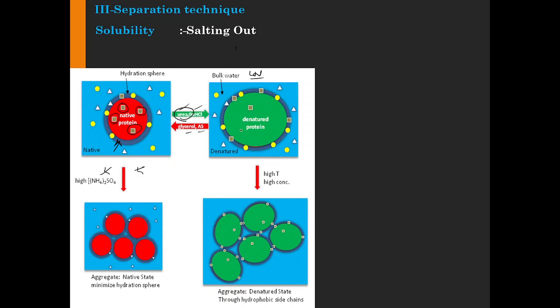They flip all the residues, and they basically denature the protein. Now in some places, in fact, people can refold the protein, because if the protein has been unfolded, meaning denatured, or its structure has been affected, there are certain renaturation buffers people use. Sometimes I take the liberty to tell you this also as a knowledge point.